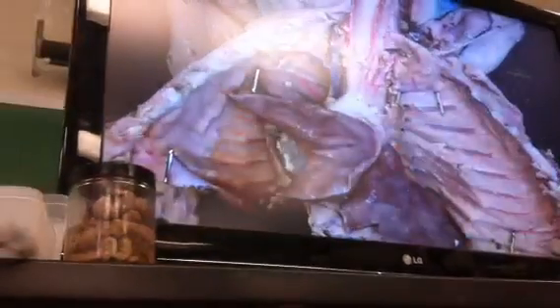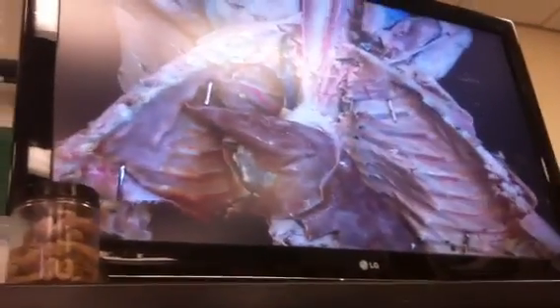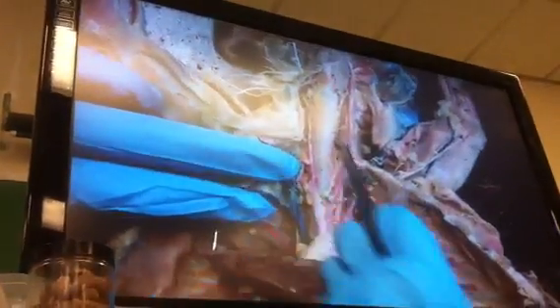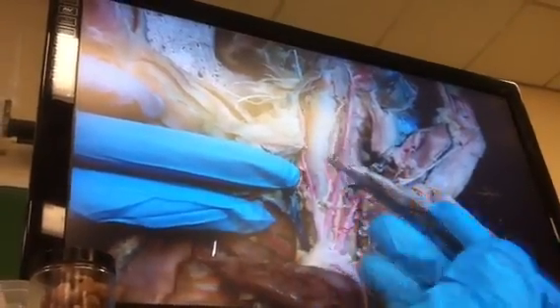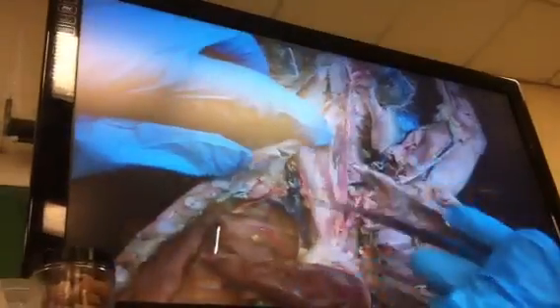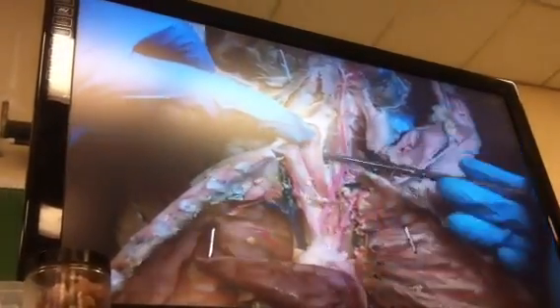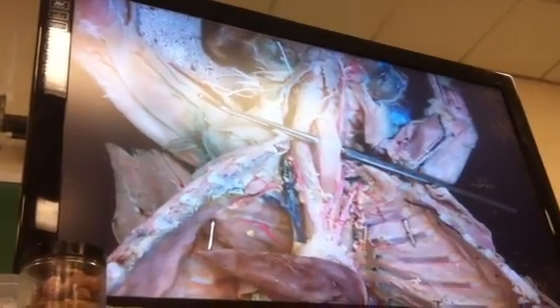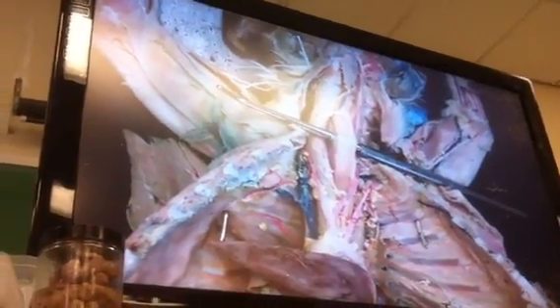I don't even see where the esophagus is. Fair enough — you're going to see me focus in on everything up here. In order to find the esophagus, I've got this structure called the trachea. I'm going to take the trachea and retract it. When I take the trachea and retract it, you see this collapsing tube that's right behind it — retro, behind it — that is going to be the esophagus.